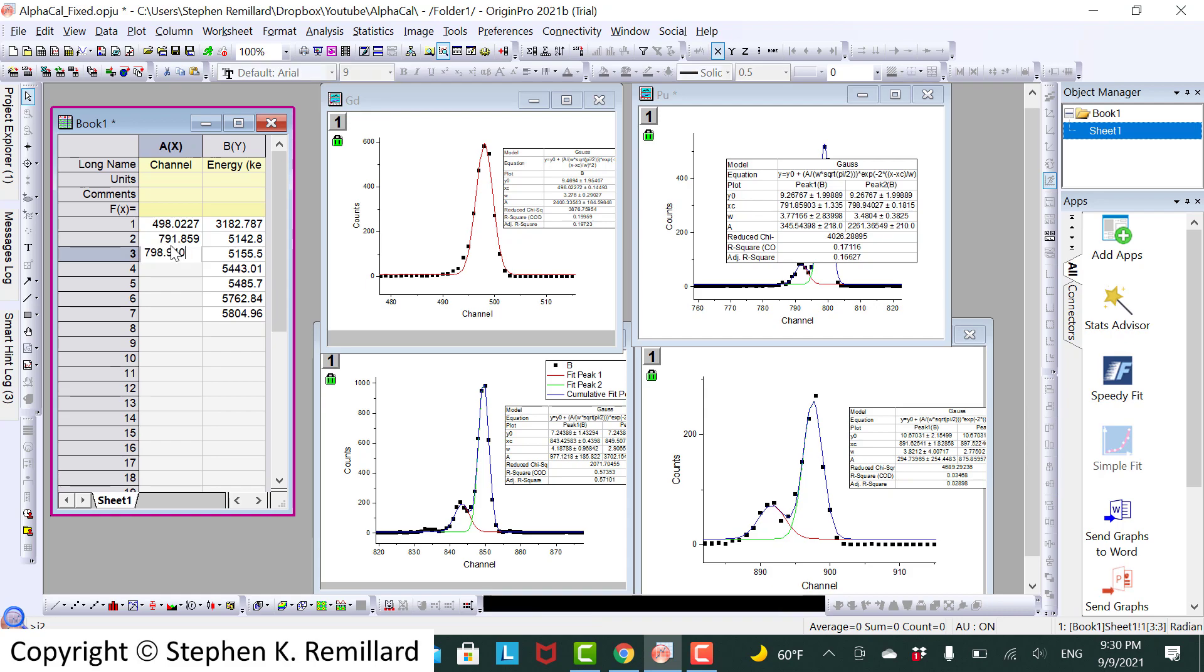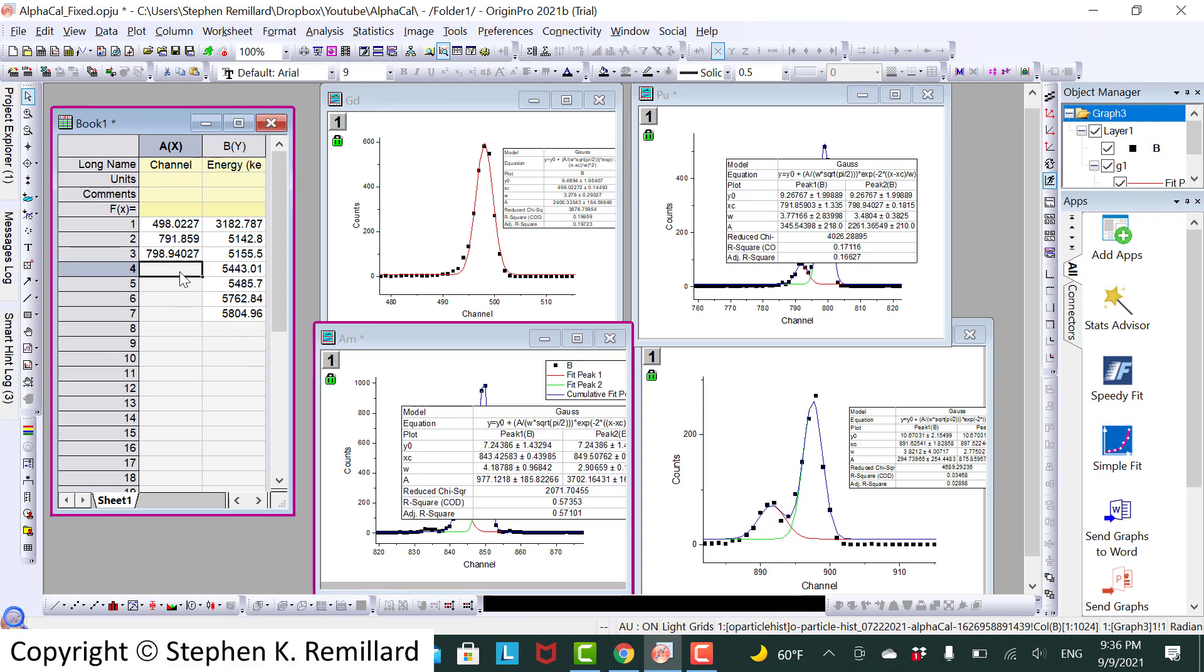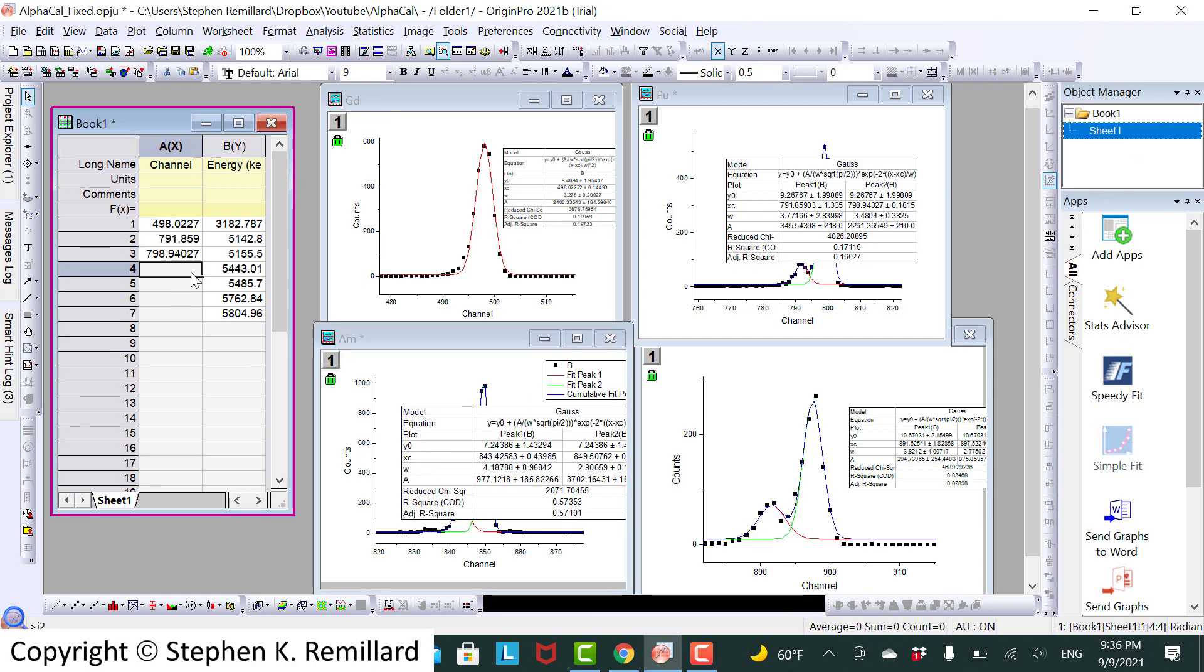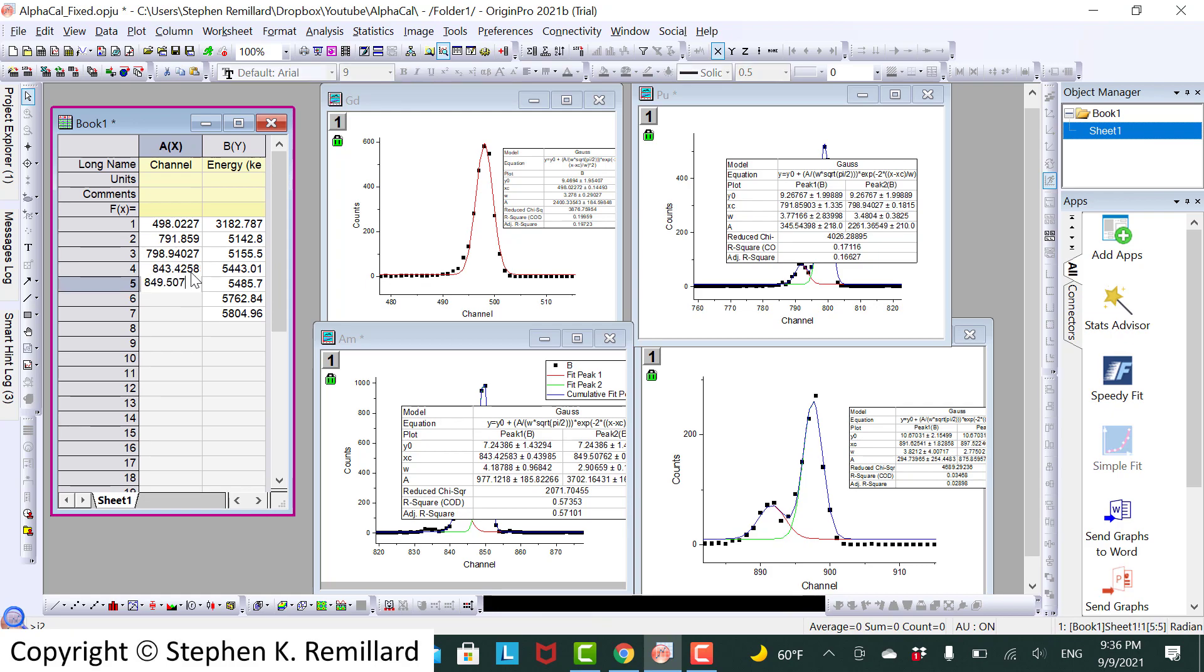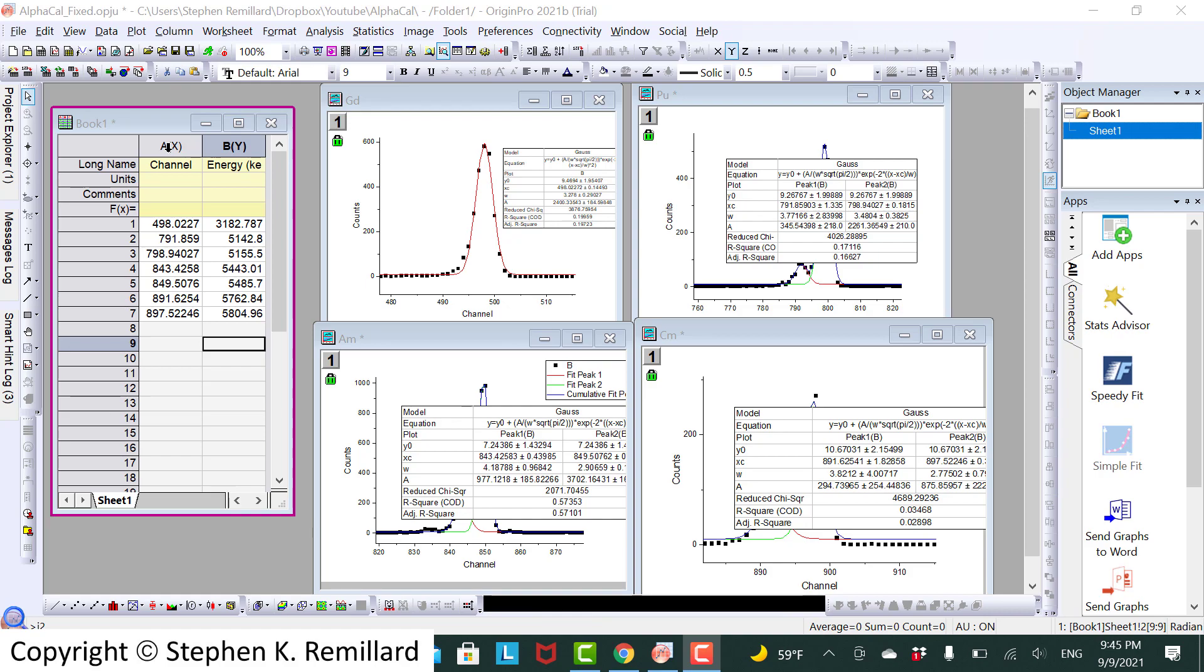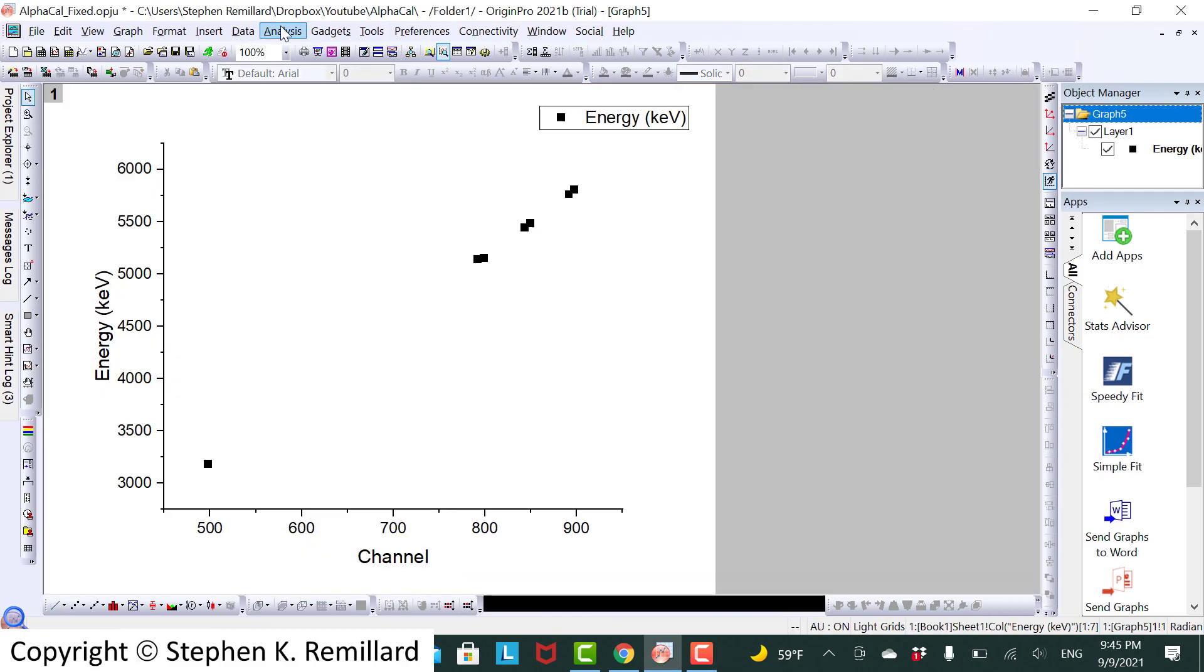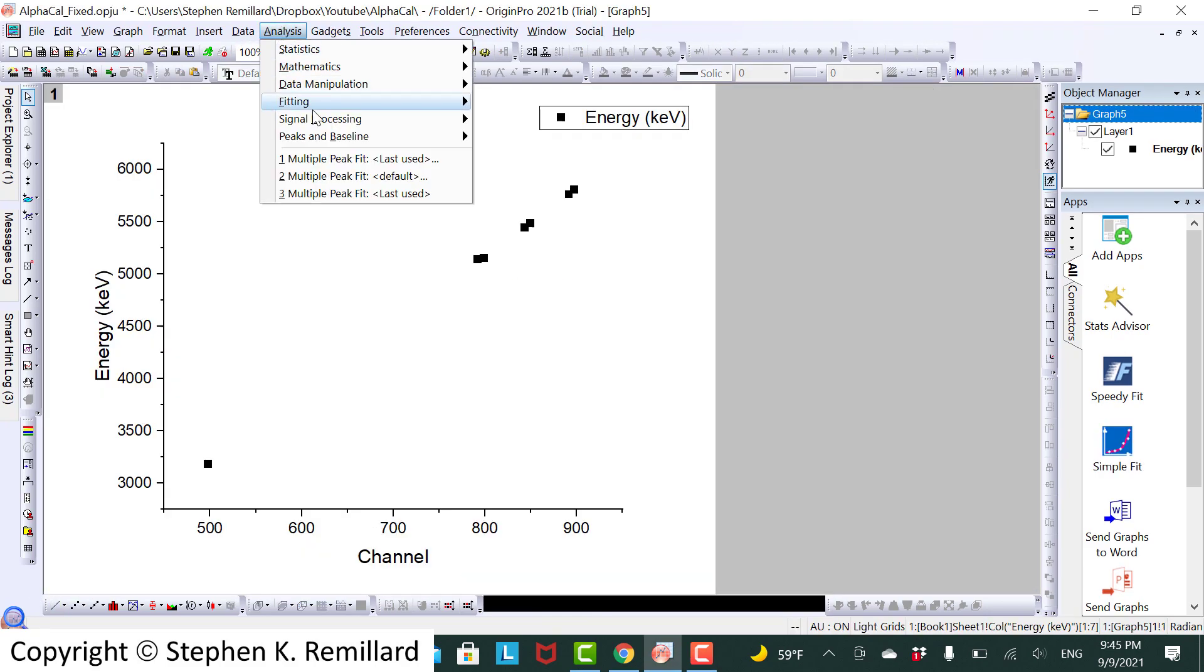The americium peaks are at 843.4258. And finally the curium peaks. Graph this and do a straight line fit.